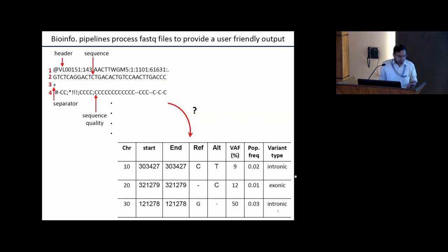And to analyze this kind of data, what do you need? So the output, first of all, is a FASTQ file. That means it looks like this. Most of you have seen, some of you will see today. So you have to go from a FASTQ file like this to an output like this in a tabular format, which most of you are accustomed to seeing. So how do you actually go? That's what a pipeline does. It takes you from here to here, right?